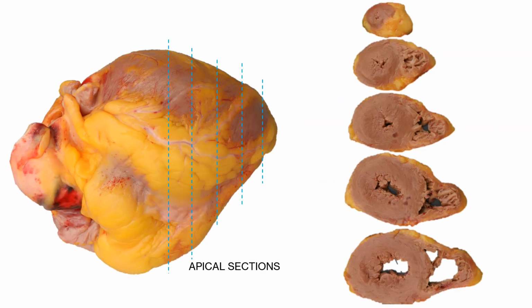In adult hearts, this is our standard practice. When we discuss pediatric hearts, I'll reserve that for in the field learning for now. But for adult hearts, we will do these apical to mid sections. This will not be performed in our standard pediatric cases, but this is the method for most adult hospital autopsies or adult autopsies in general.